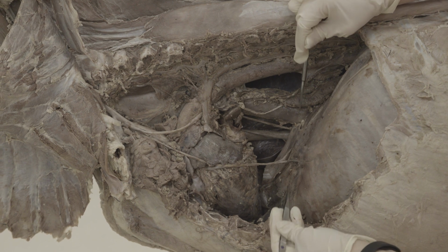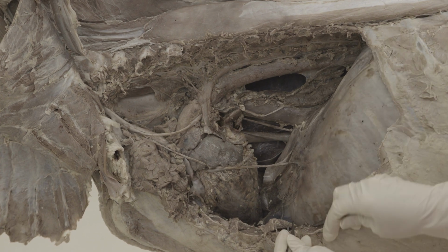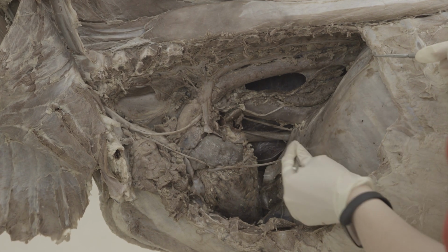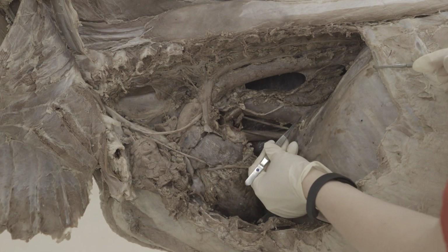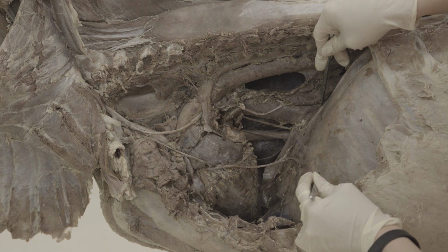So we'll continue on and look at the diaphragm for just a moment. We have the diaphragm here, obviously, and the tendinous center is kind of the same as it was in the pony. It's that see-through part here. And we have the esophageal hiatus, so you have the esophagus here, and the hole through the diaphragm that the esophagus runs through is the esophageal hiatus.